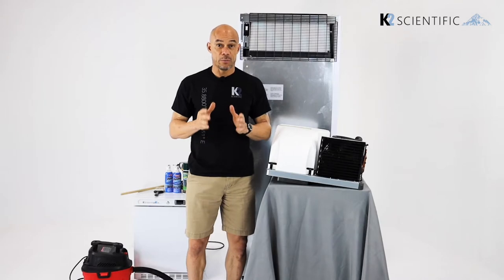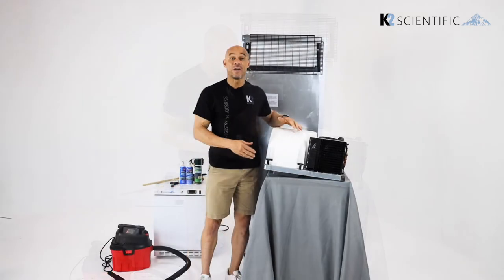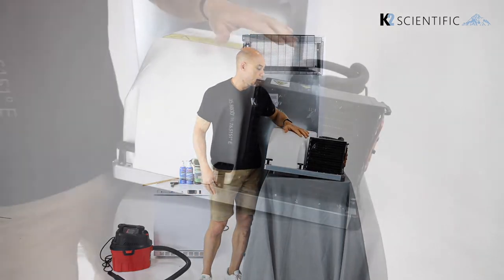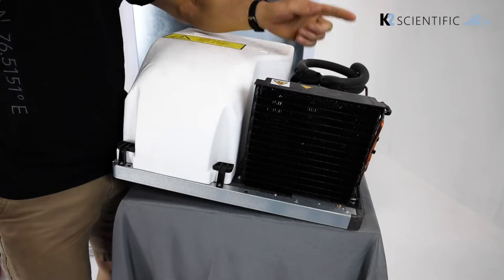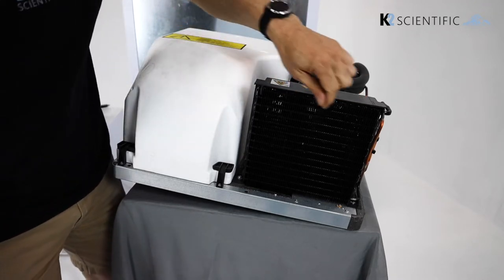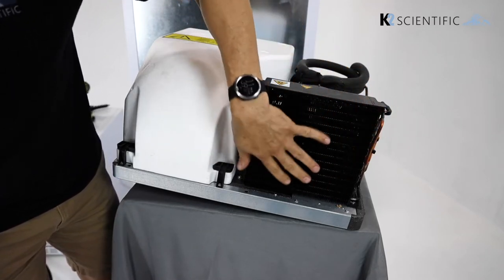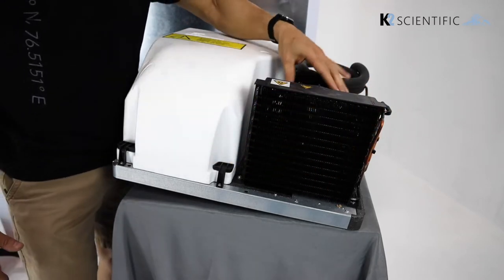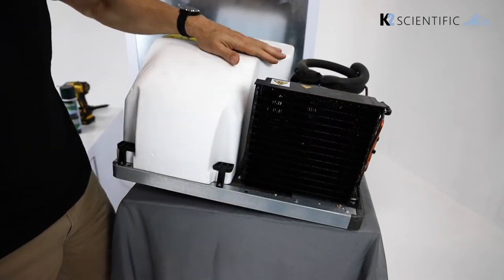The condenser is one of the most essential components in your refrigeration unit. Right here we have a monoblock from our K2 unit. The job of the condenser is to remove the heat from the cooling process. The condenser is a series of coils that weave back and forth and fins. Behind the condenser is a powerful fan that blows air, removing the heat from the cooling process.